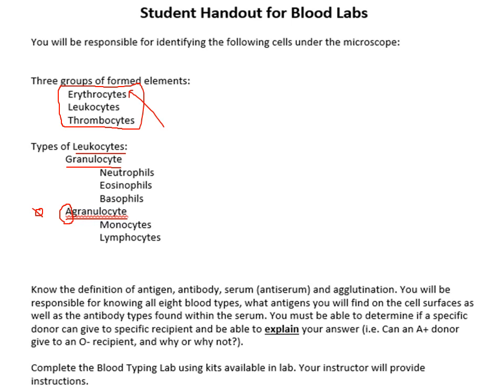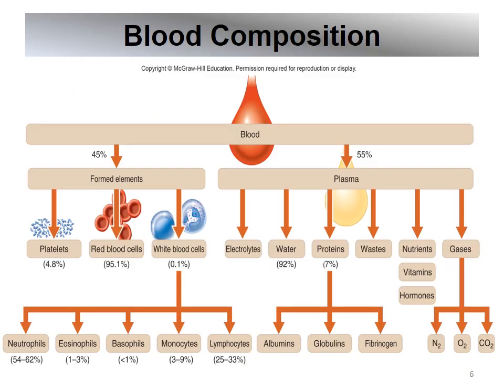And so we're going to look at, there's five different types of leukocytes. And again, they're divided up into granulocytes and agranulocytes. And you can see them down here as well. This lists them in their groups. These are going to be what we're going to call the granulocytes, and these are agranulocytes. Now, before we look at some of these pictures, I'm going to describe what you're looking for. With these pictures, I want you to be able to recognize some certain characteristics of these. Now, one thing I do want to say, an agranulocyte actually does have granules. You just can't see them. They're not the prominent feature of it.